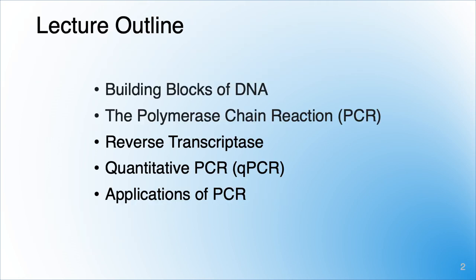The broad outline for today's lecture will be the building blocks of DNA, the polymerase chain reaction, reverse transcriptase, quantitative PCR, and applications of PCR.